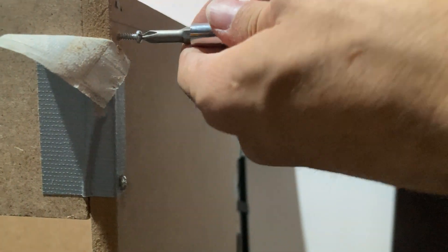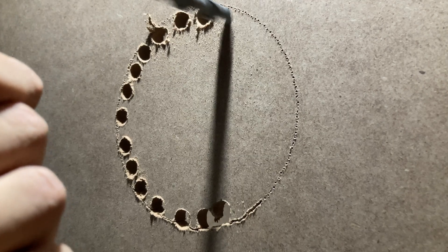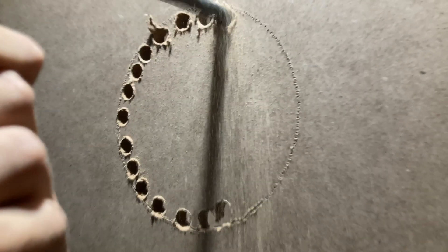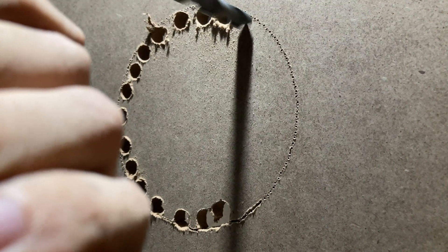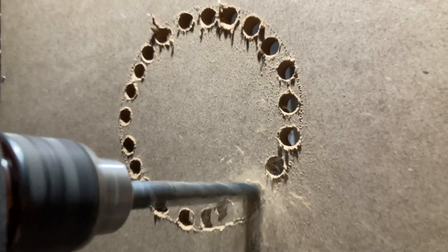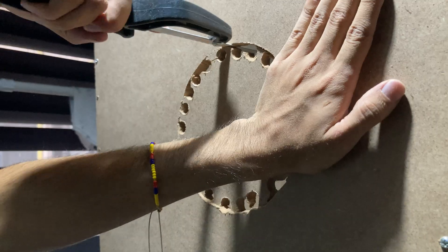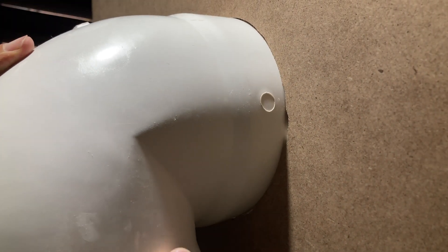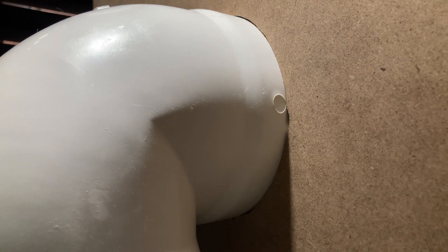Building the fume hood was actually really easy — I just used some screws to attach everything together. The hardest part was opening the hole for the fan, because I had to open several tiny holes and use a saw to cut between them. I then put the pipe through the hole and secured everything in place with duct tape. I also added a tiny activated charcoal filter, but I'll be honest — I don't think this filter is really doing much at all.